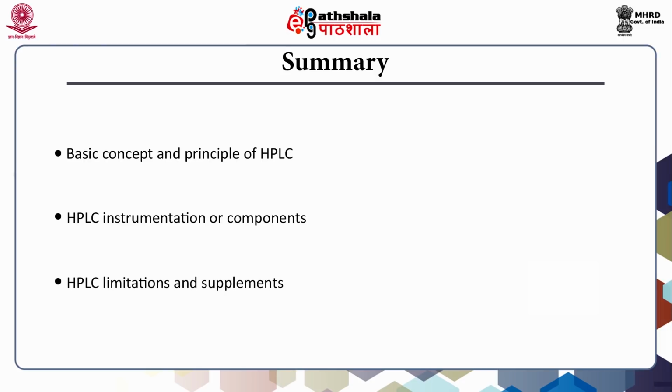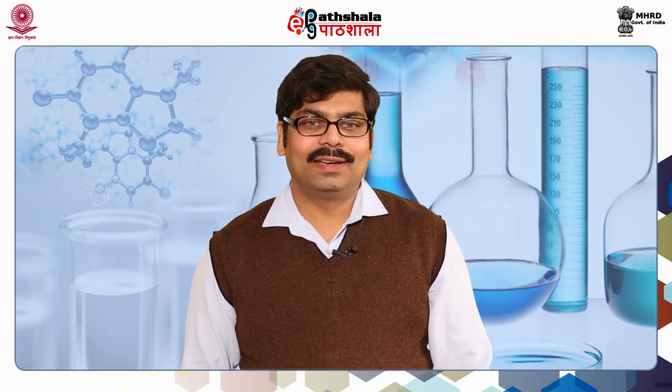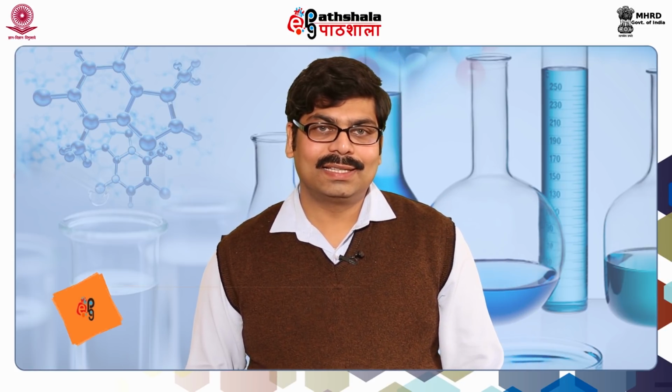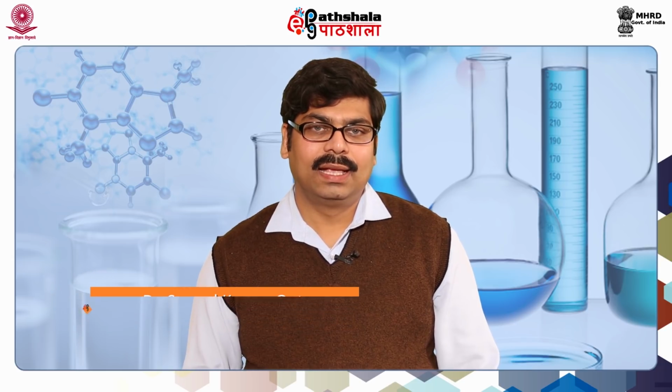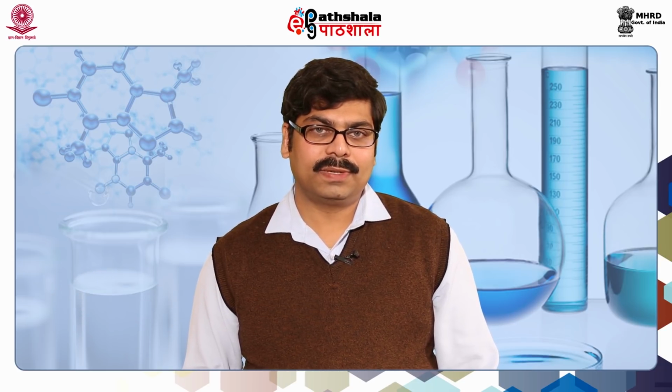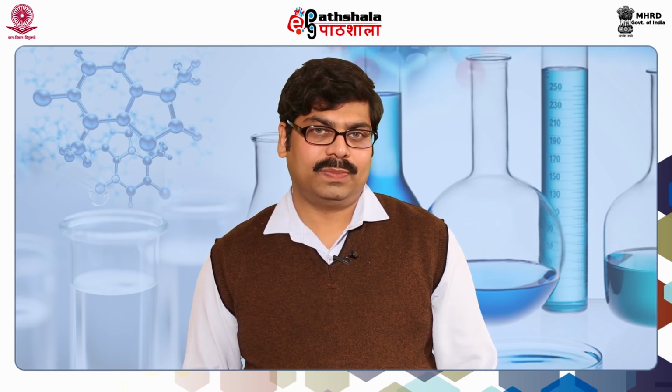Overall, in this lecture, we have discussed the basic concept and principle of HPLC, HPLC instrumentation or components, and HPLC limitations and supplements. Dear students, I hope you enjoyed this lecture, and I consider that you understood the basic principles of HPLC, the instrumentation of HPLC, the techniques of HPLC, the limitations of HPLC, and the alternatives for HPLC.